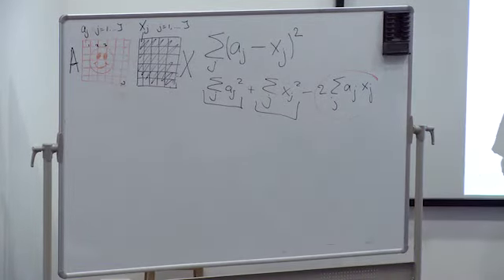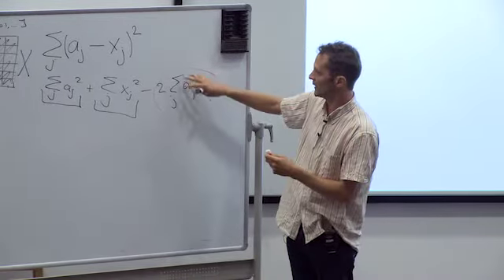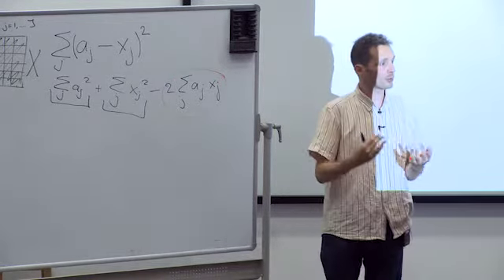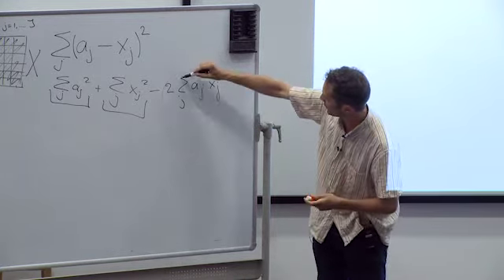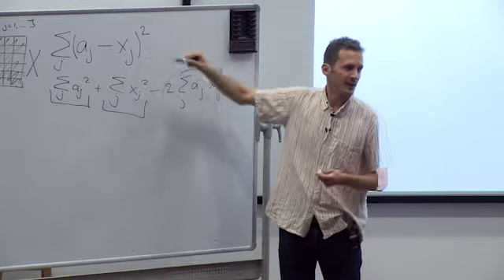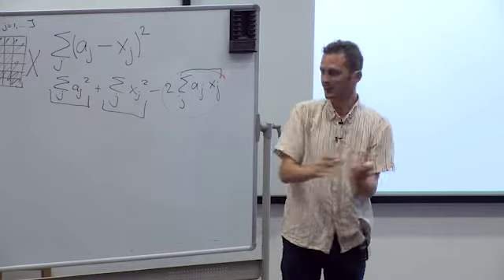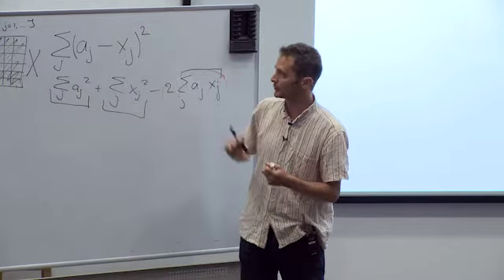And this is actually the main part of the cross-correlation coefficient. There are some other things going on to make it invariant to scale and so on, but we won't go into detail. So if you do maximum cross-correlation coefficients, then we actually want to maximize the cross product. If that's maximal, then because of the minus here, this term will be minimum. That's where maximum cross-correlation becomes the same as least squares, because if you maximize the cross product, then the square difference becomes the smallest.